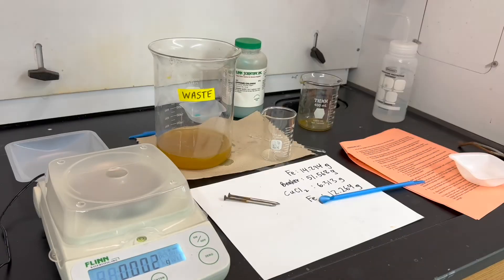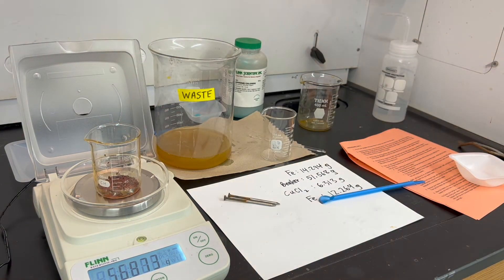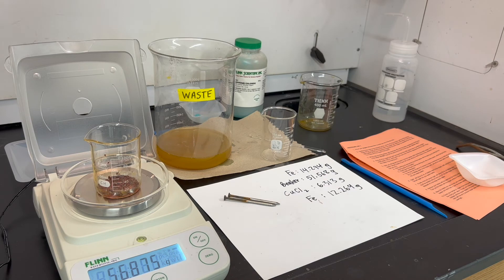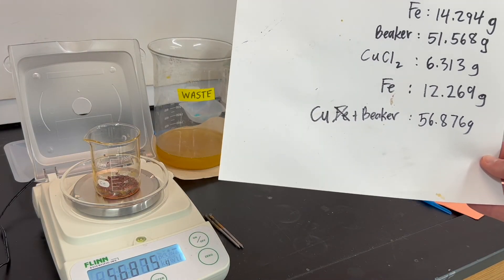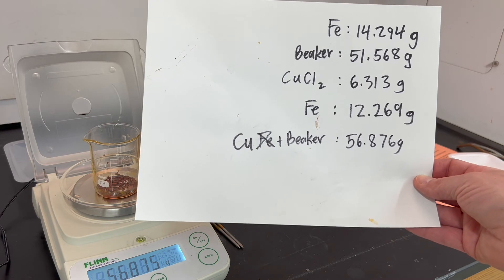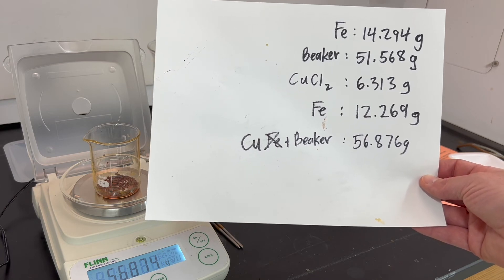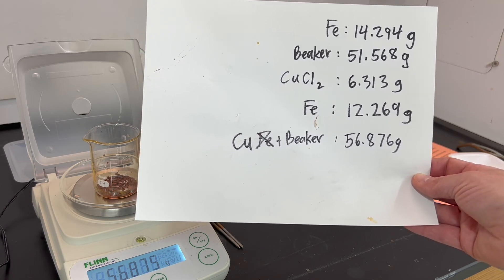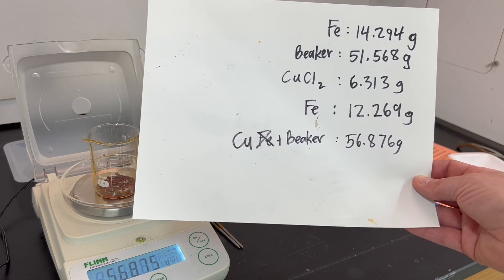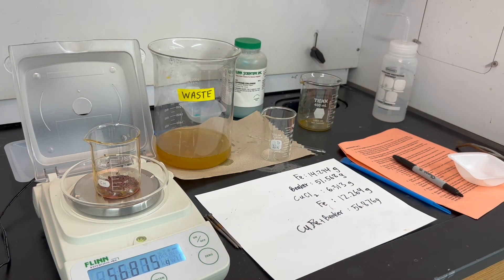I'll zero the balance and place the entire beaker on it — I'm seeing a value of 56.876 grams. Quick correction: what I measured was the mass of copper plus the beaker at 56.876 grams. You should have measured the empty beaker mass on day one, which was 51.568 grams. Subtract that empty beaker mass from 56.876 grams to find how many grams of copper were produced. Some additional drying is expected overnight, so adjust that value accordingly on day three.